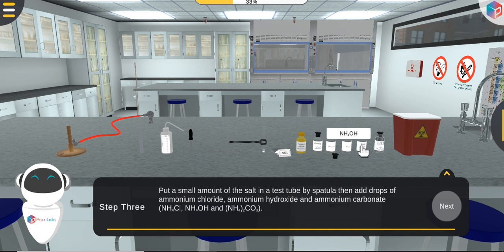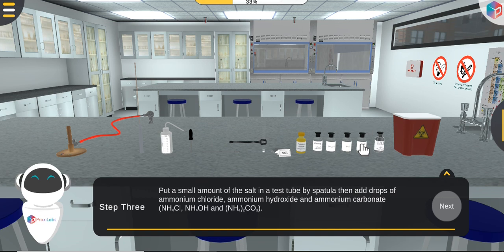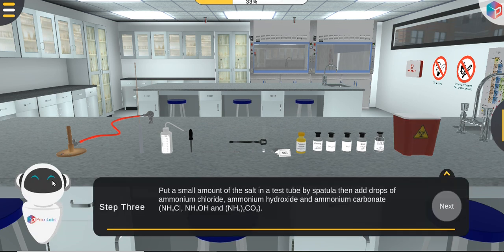What do I see? What will be my result? Next is hydroxide.